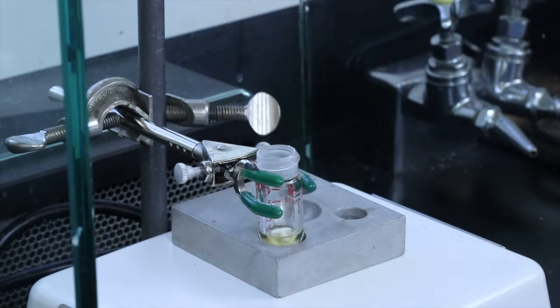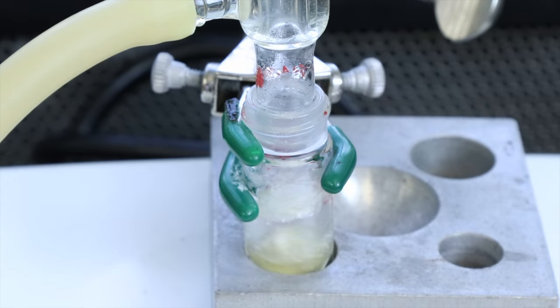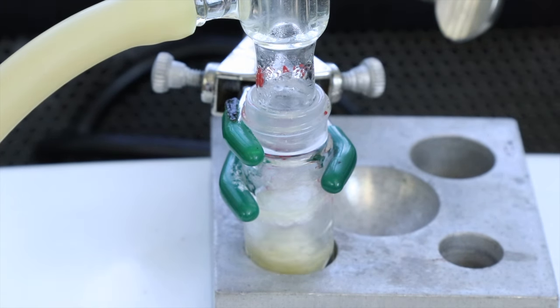Now I can set up the apparatus and I'll let everything reflux for an hour. And you can actually start to see the solid alcohol product forming here. You can see it in that kind of white pasty film on top of the liquid.